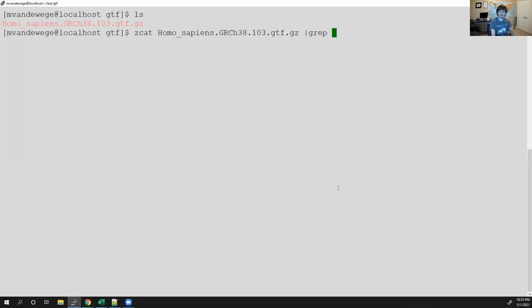So with this information, I can grep out specifically protein coding genes. But I don't want all of those lines that have transcript, exon, CDS, 5' UTR, etc. in them. So I can, for example, grep -v exon. But I can't grep multiple words with grep. I can only do one grep, one word. I can't do grep protein and grep -v exon in the same line. It has to be an individual grep command, all connected together with this pipe.